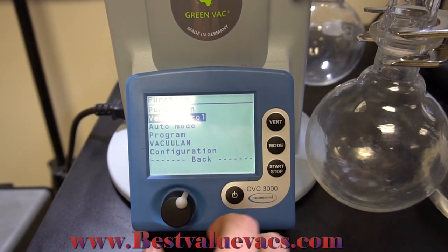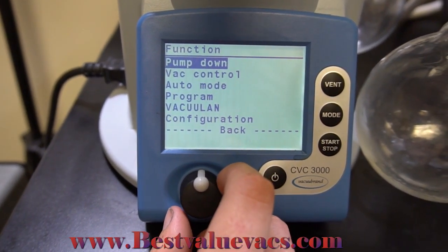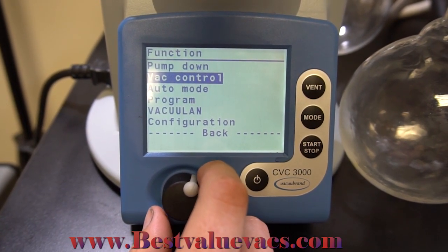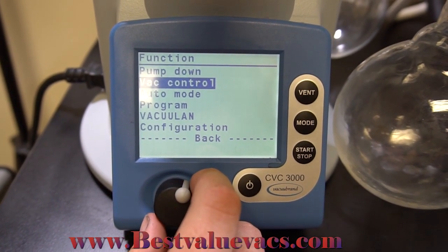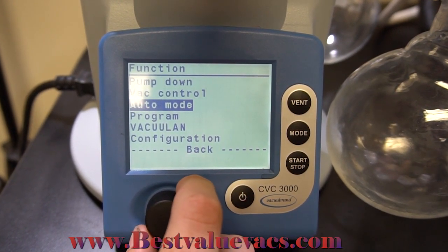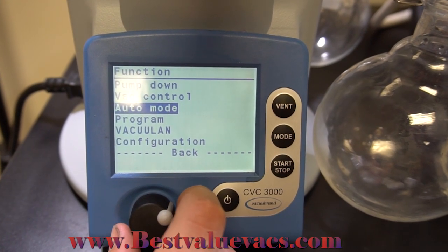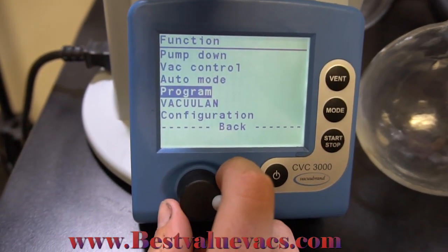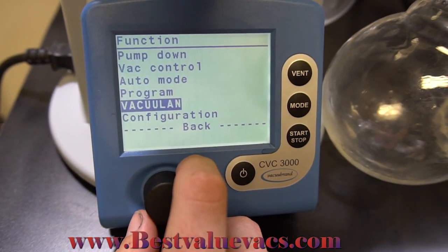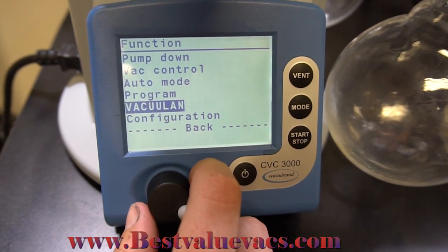On our mode screen we have different functions. We have pump down, which will pump all the way down to the highest possible vacuum level. We have vac control mode, where you set your vacuum level and the pump will try to maintain it. We have auto mode, where the pump will find the boiling point of your solvent. You have program, where you can enter your own program with an external device. And then we have VACUULAN, which lets you hook up additional pumps all controlled by the same screen.